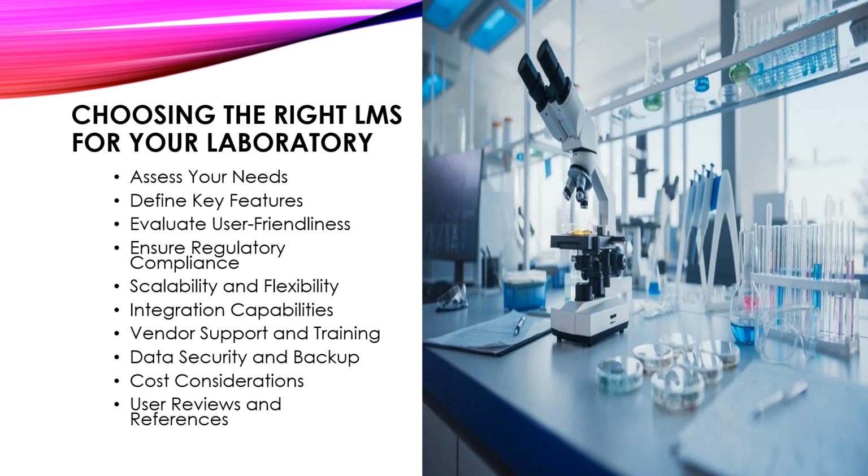Ensure regulatory compliance. Compliance with regulatory standards such as CLIA, CAP, FDA, and ISO is crucial for laboratories. Choose a laboratory management system that offers features to help maintain compliance with these standards, such as electronic record keeping, audit trails, and quality control management tools.